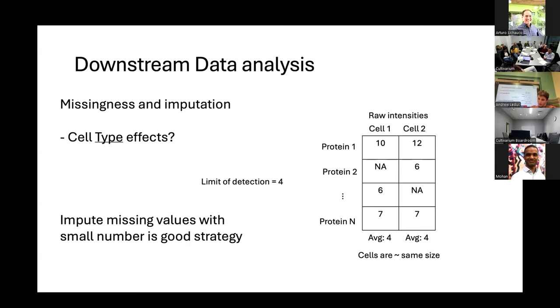Yeah, for sure. There are certain analyses where the absolute copy number is more important than the concentration. In these cases, normalizing by the histones can give you a better sense, because if you have two cells, you should assume that their histone numbers, roughly speaking, are exactly the same, as they're both in G1. So you can use this histone concentration normalization to try and exclude noise that might come from one cell not being prepared as efficiently as the next, which would result in variable histone amount. But you might want to do a first normalization. There's a lot of work that still can be done, and it's not stuff that I've really implemented.